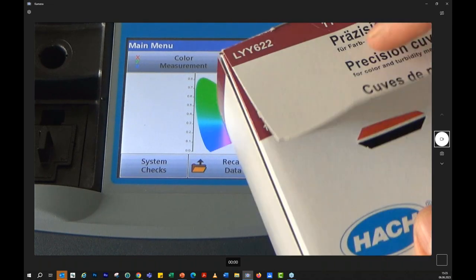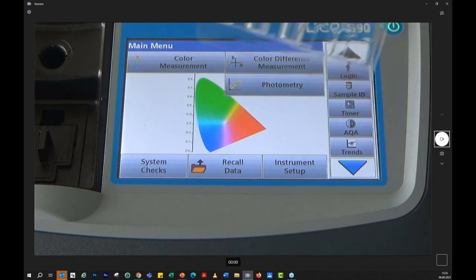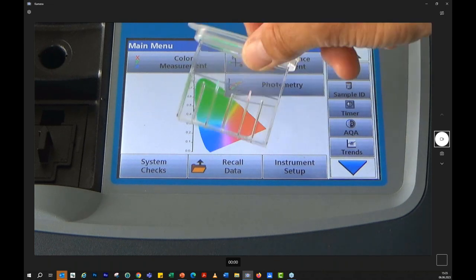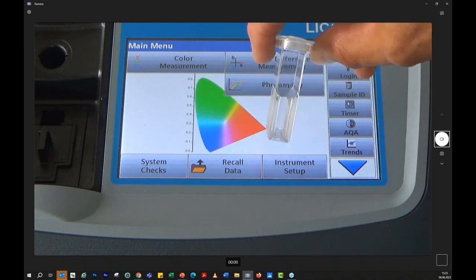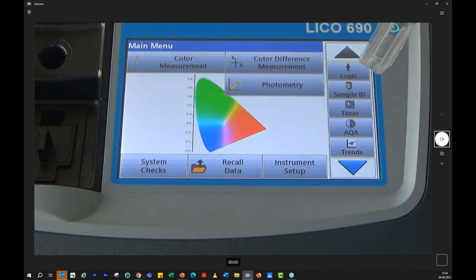Now I'm coming to an end for the presentation. Also, the round cuvettes are available, 11 millimeter, to measure liquids with a higher intensity, to get also an overview about what is possible to use different types of cuvettes. These are the rectangular cuvettes for different liquids, and of course also the light beam is passed through this cuvette here in these positions, approximately 1 centimeter high. Therefore, also this part of the cuvette has to be subject of a very intensive cleaning. Good.